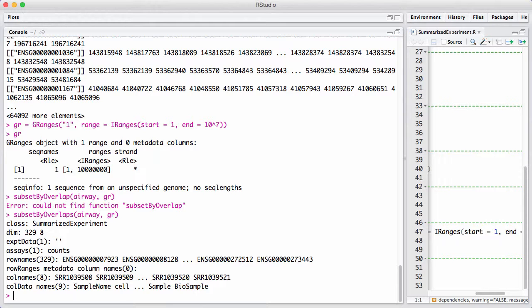So this summarizes the SummarizedExperiment data class. We access things using row and col, we have the GRanges we can access via rowRanges, and we have the assay function for getting the expression measures or whatever is measured in this SummarizedExperiment.